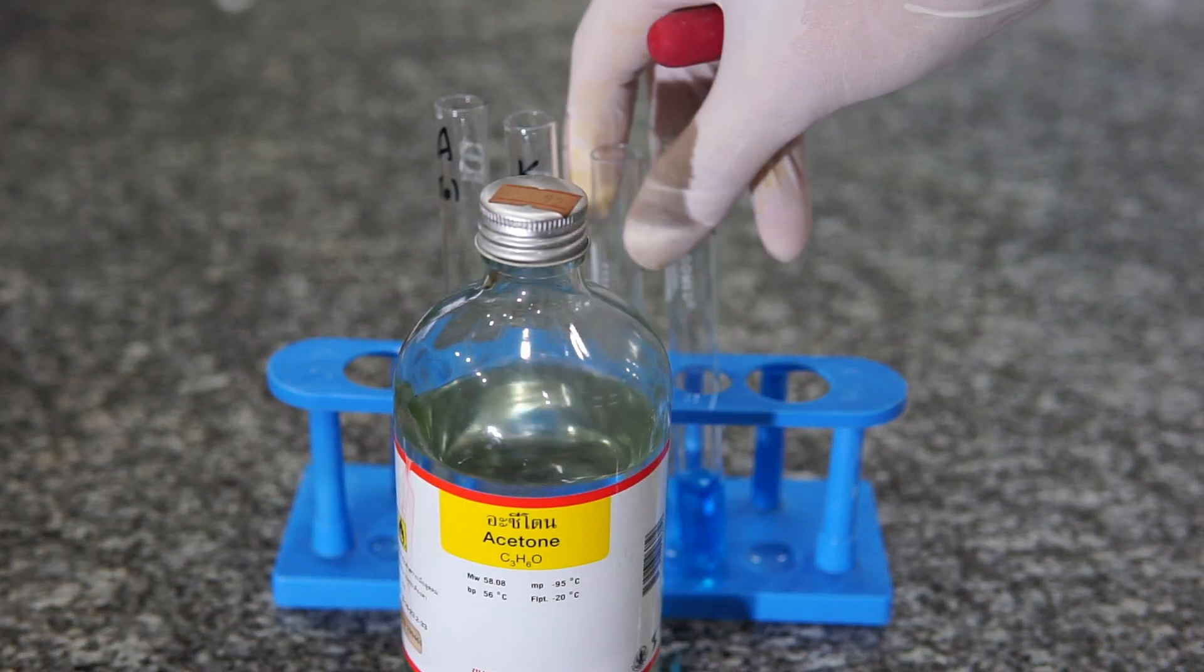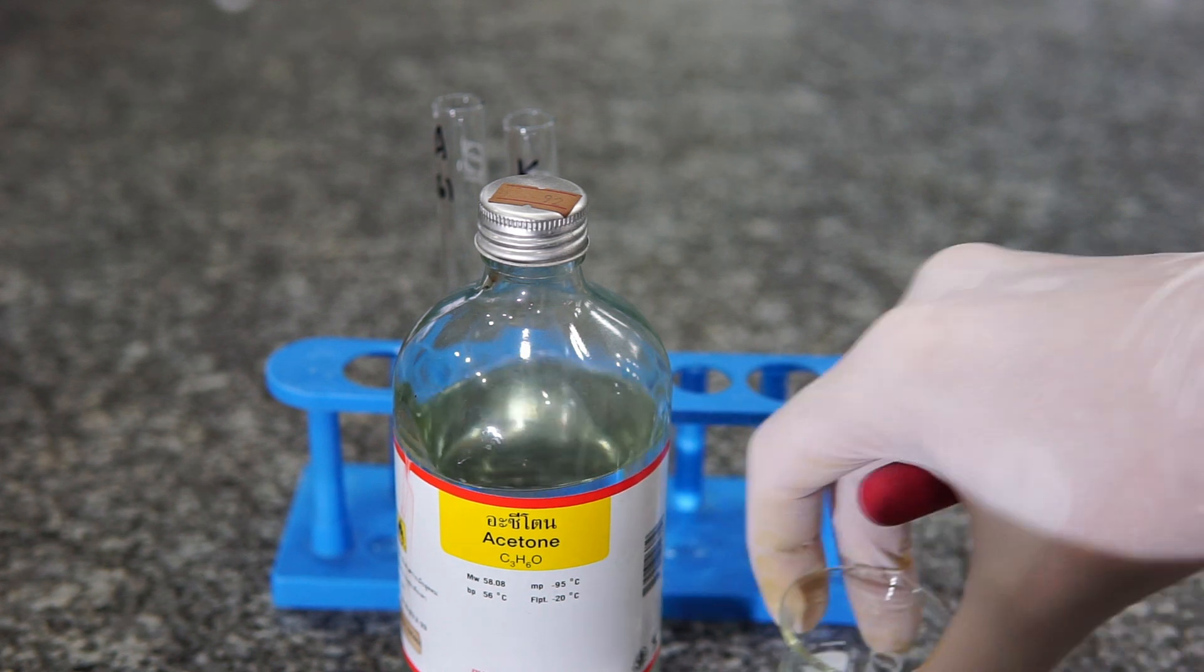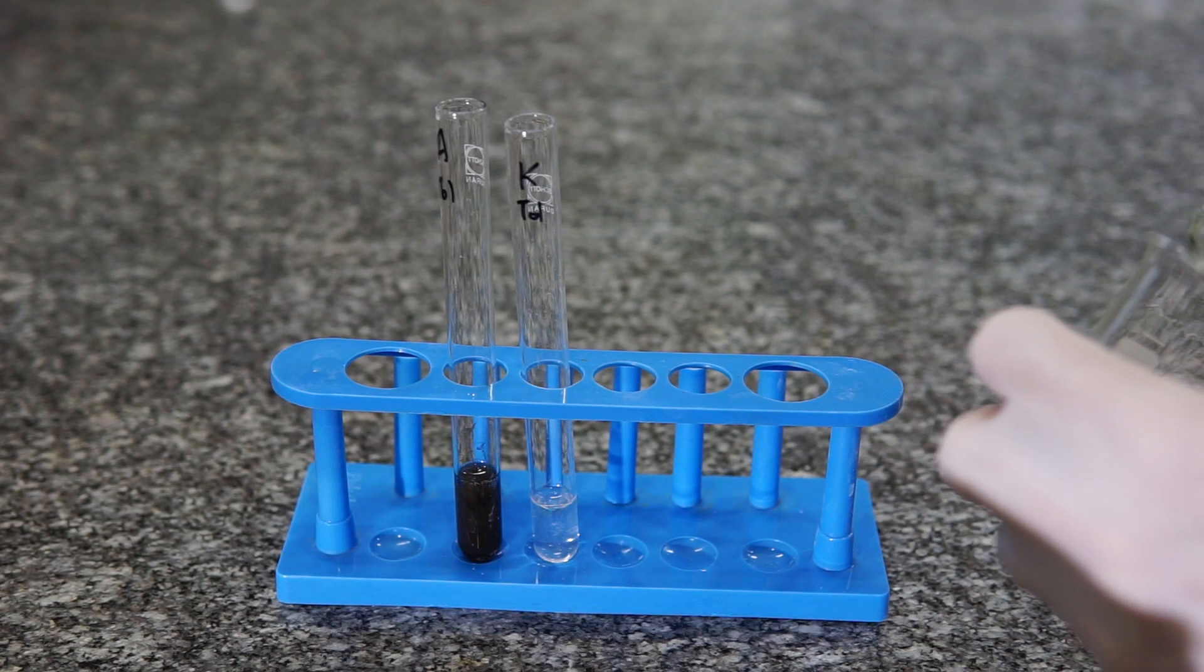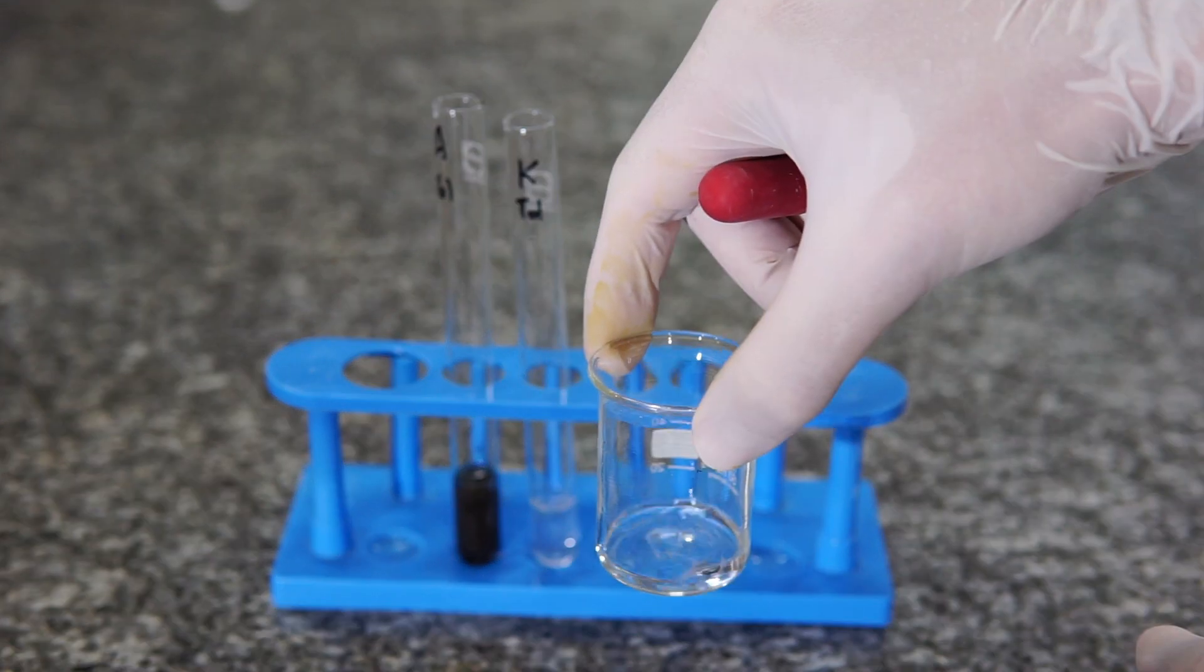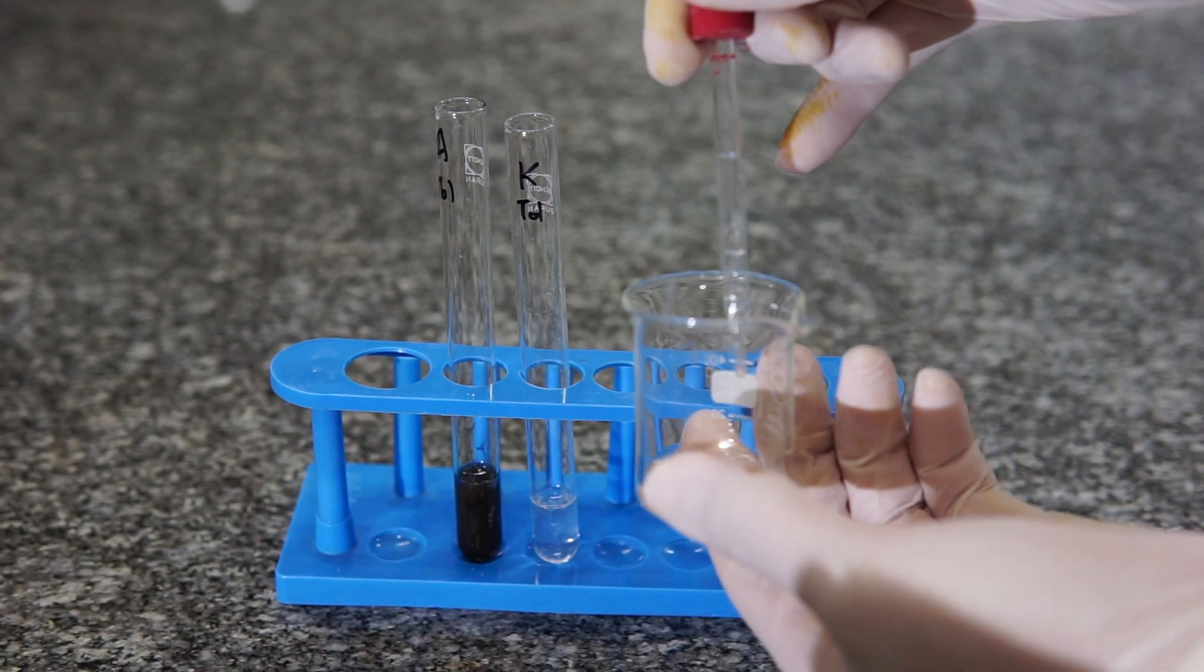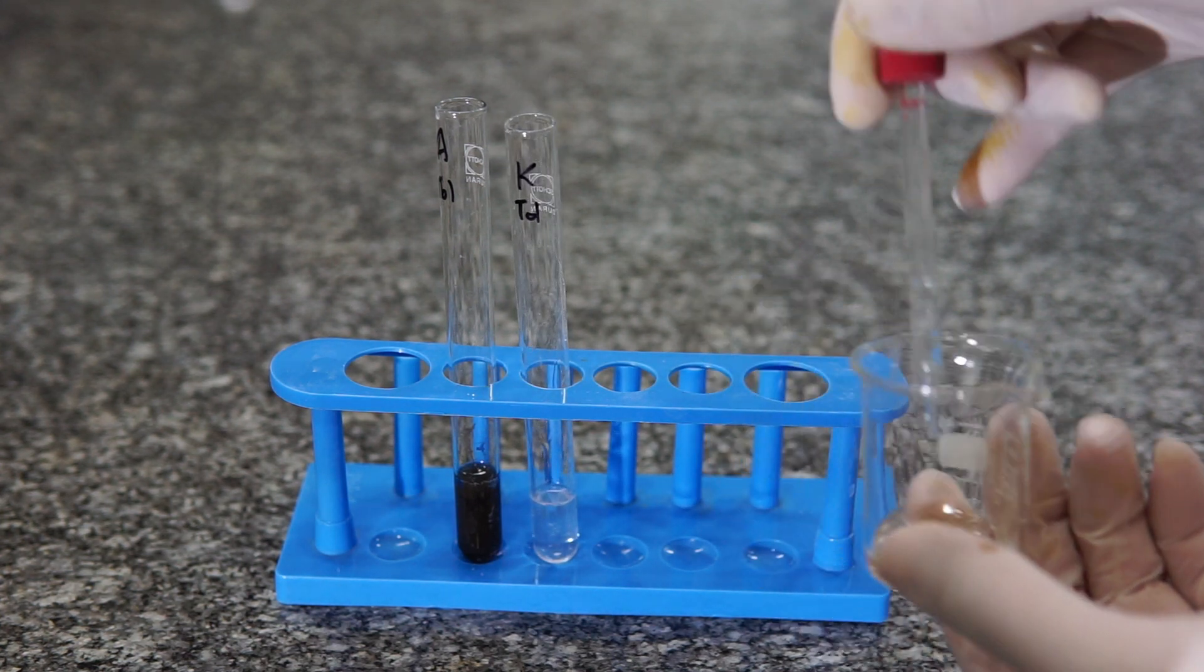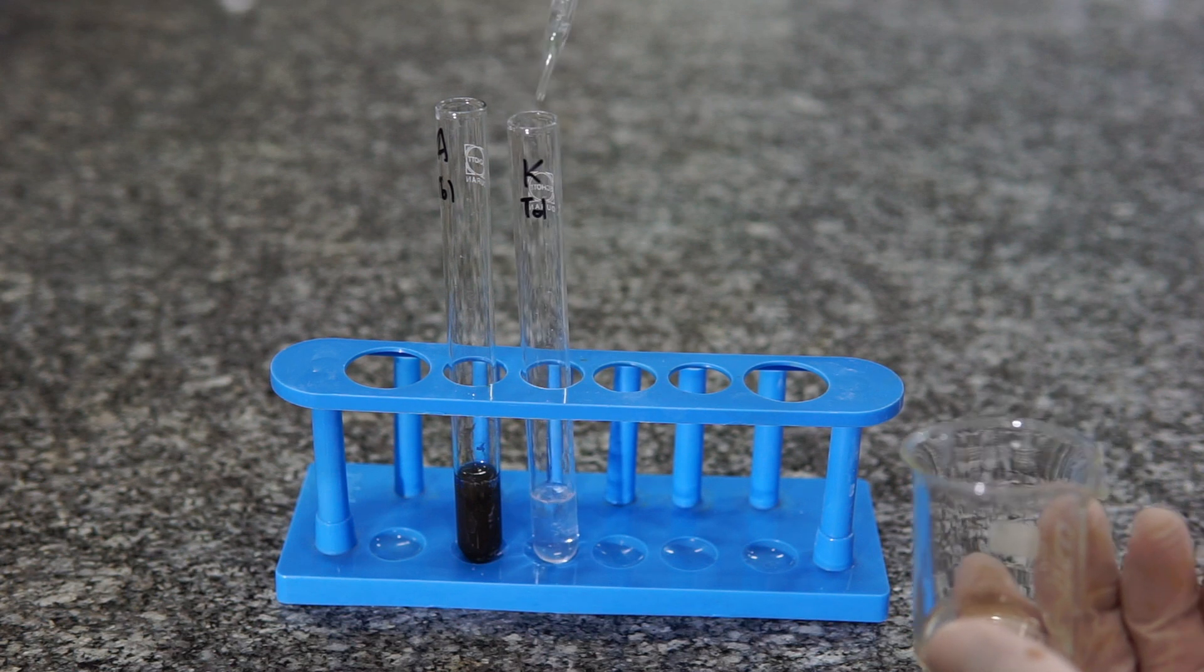That's the aldehyde. Next up we got the acetone - remember that's also called propanone. Add that to the Tollens reagent and you can see there's no obvious reaction happening, even if we add a little bit more.